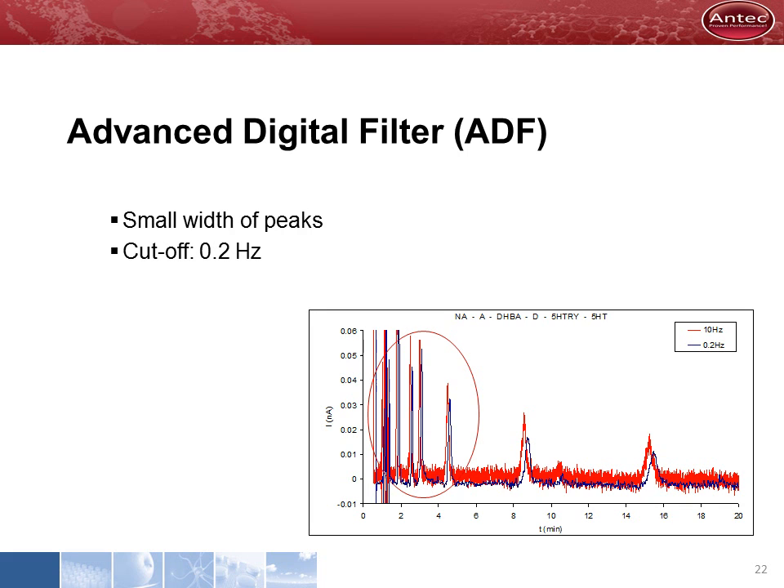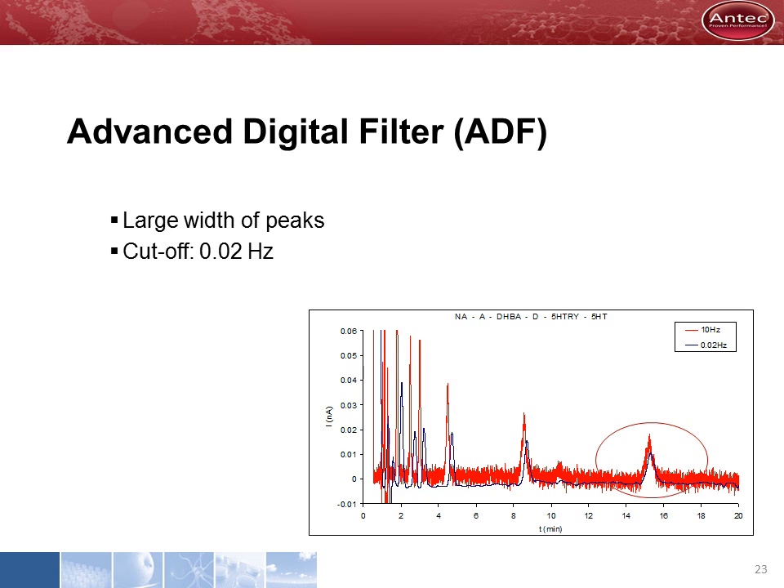The quality of a filter is best illustrated by its capability to suppress noise without affecting peaks. If the peaks of interest are in the first couple of minutes of the chromatogram, they have a small peak width, requiring a mild filter setting of about 0.2 Hz to avoid signal attenuation. The improvement of the signal-to-noise ratio is visible in the blue trace. If the peak of interest is at 15 minutes, a more powerful filter setting is applied — the peak is almost untouched while the noise almost completely disappears. The parameters of the Decade II, including the filter setting, are programmable in time using events, so the first part of the chromatogram can be filtered mildly while a more powerful setting is applied in the second part.